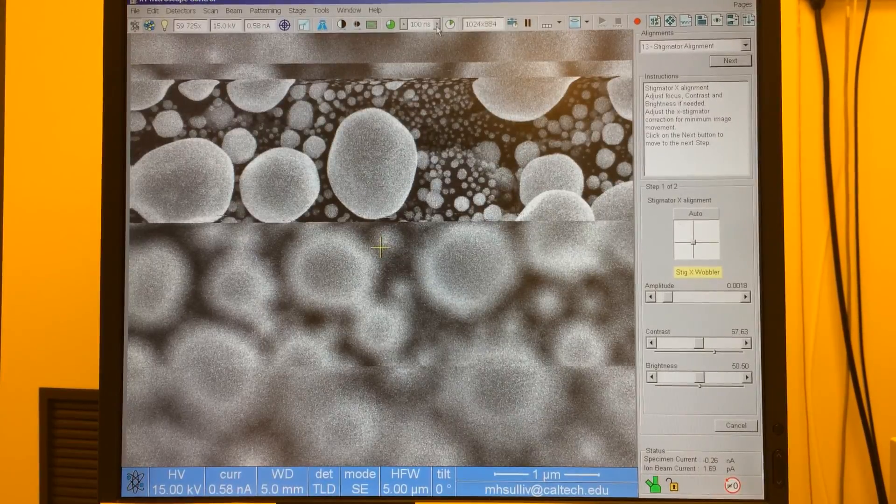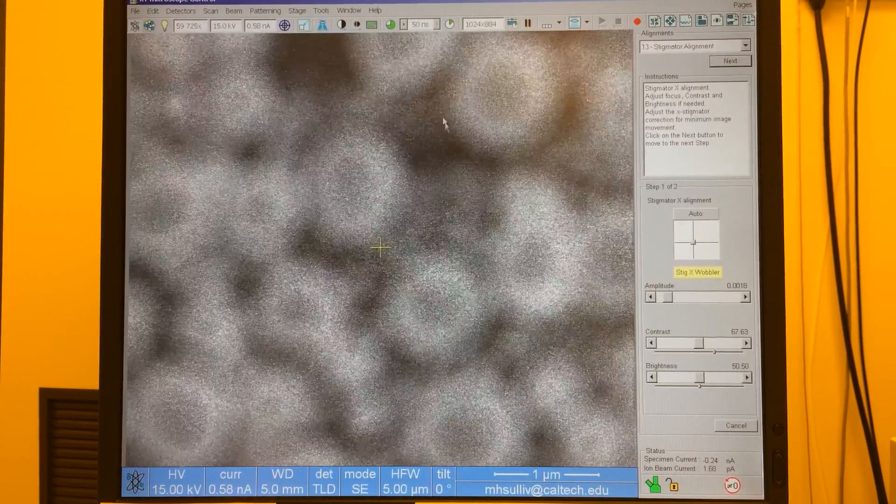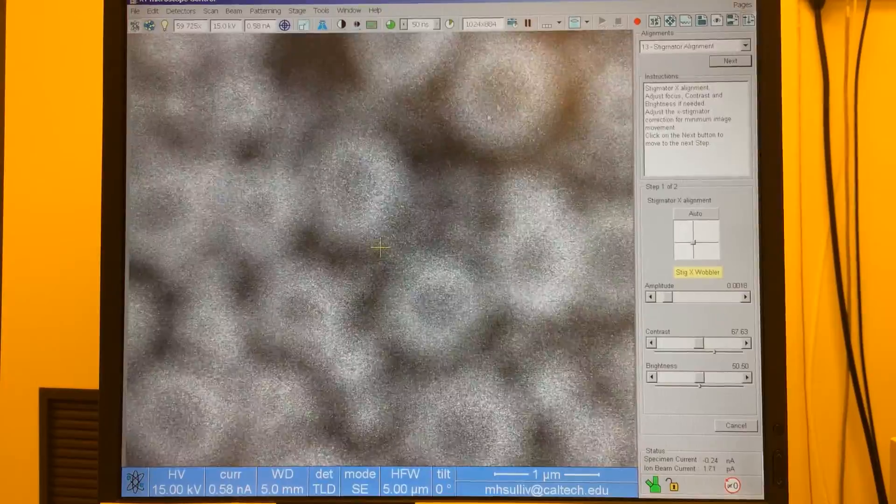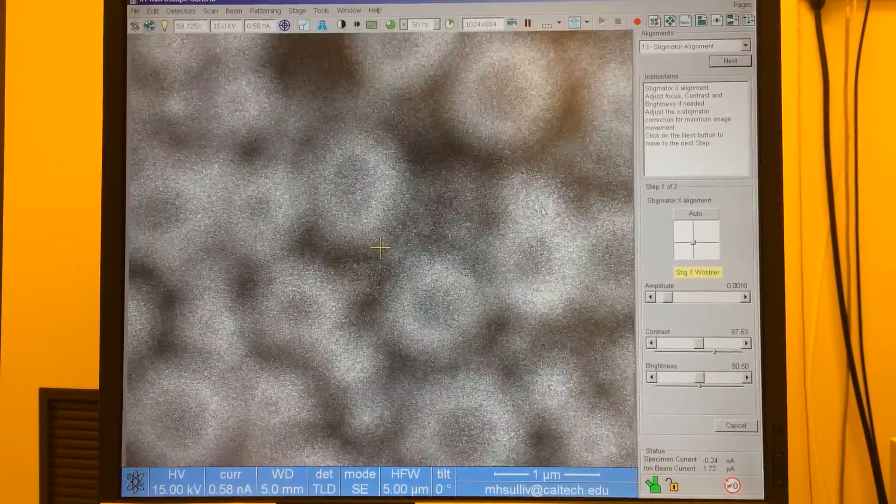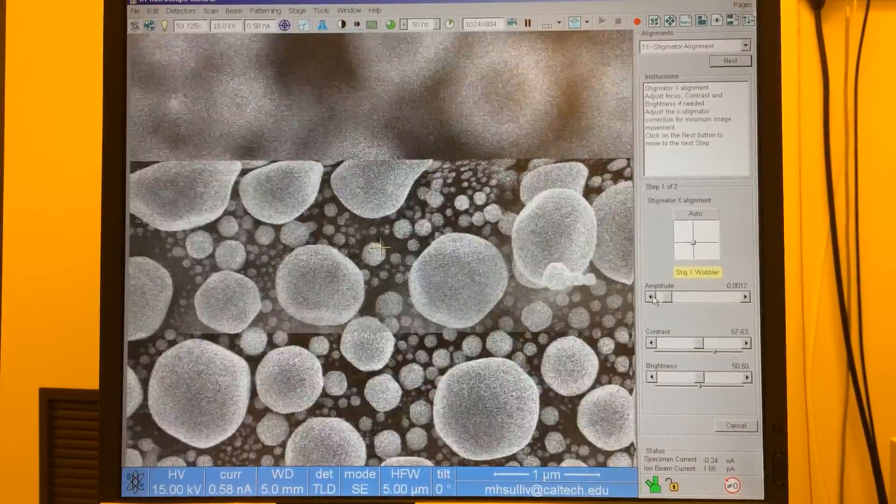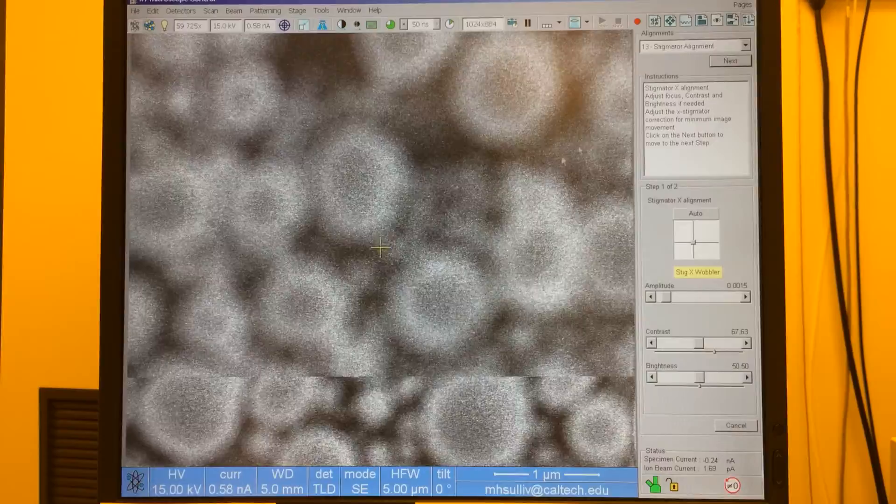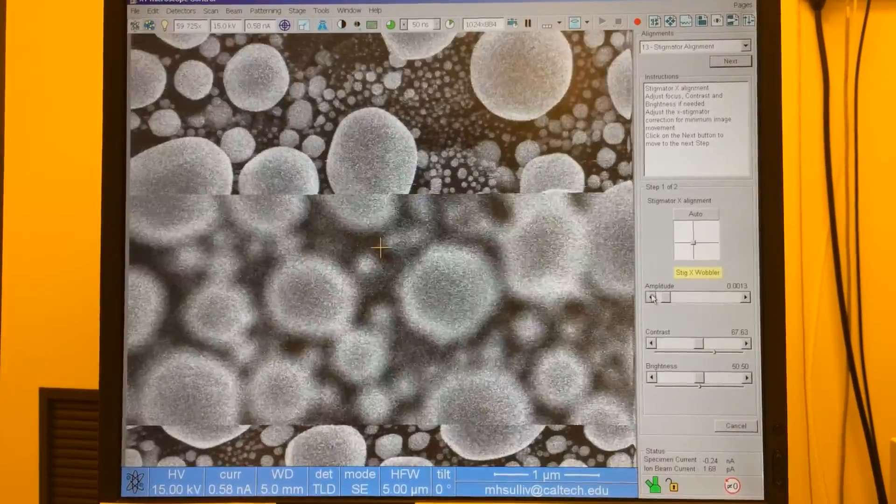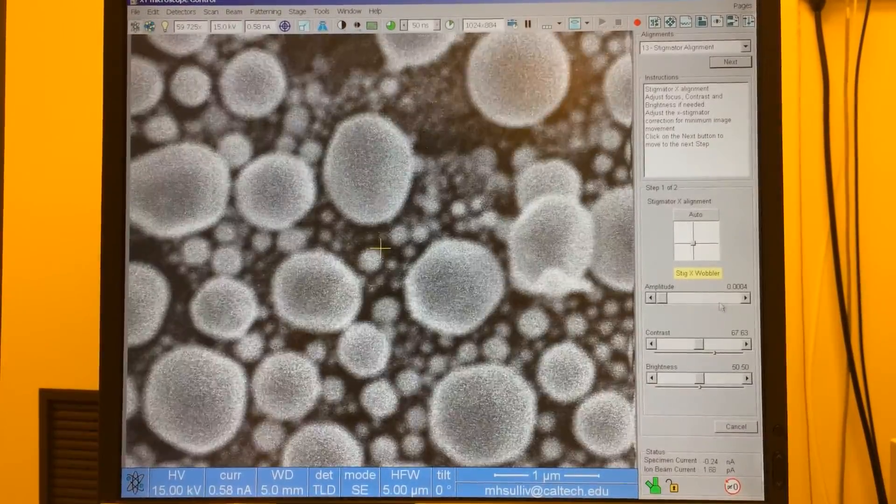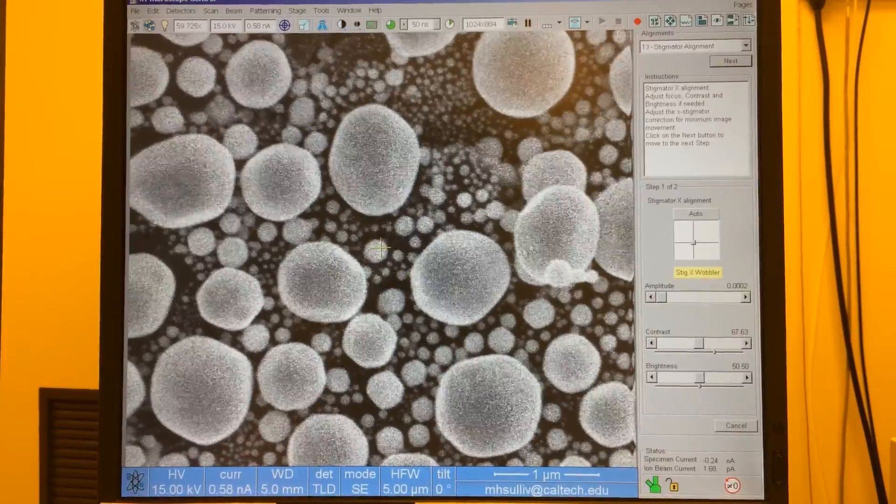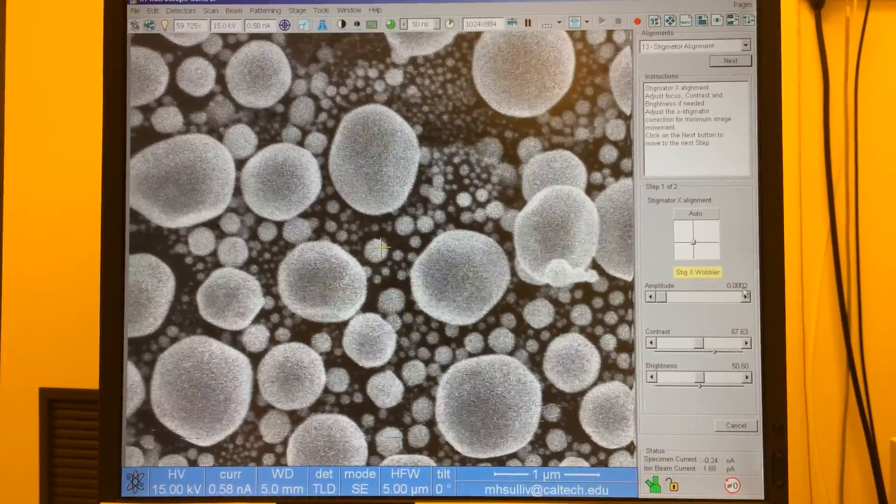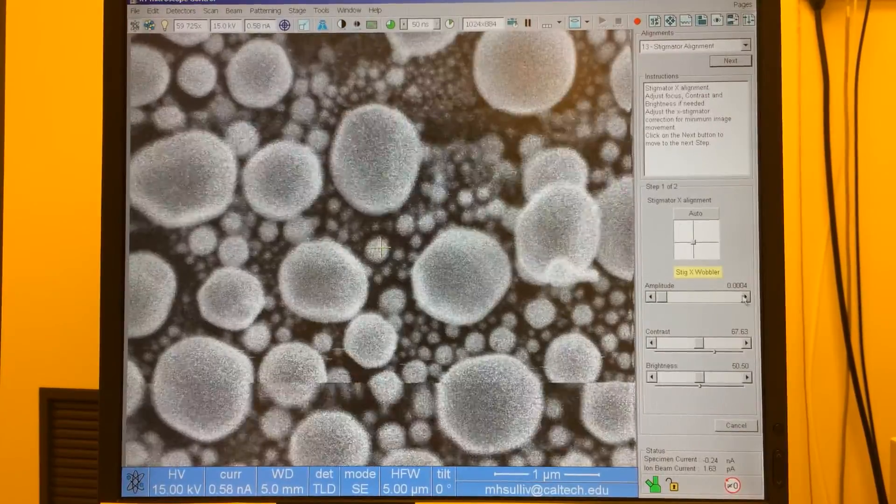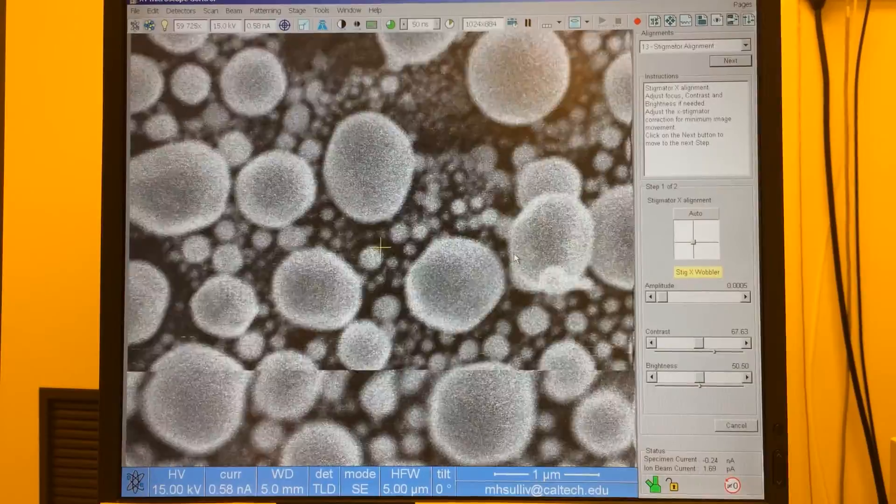We want to set up our image so that we can see the direction of our shifting and then we want to adjust the amplitude so that we can get a good view of it. So in this case maybe I'll drive the amplitude all the way down and minimize the overall oscillation and then drive it up to exaggerate it a little bit.